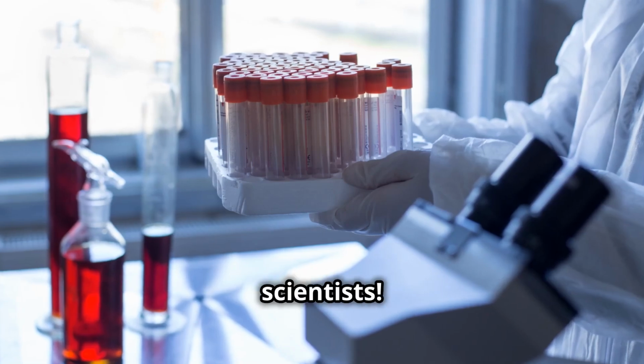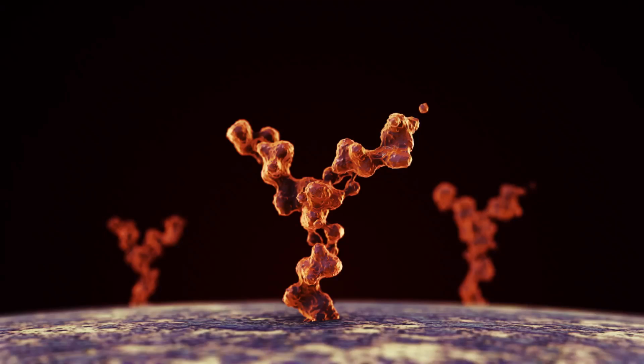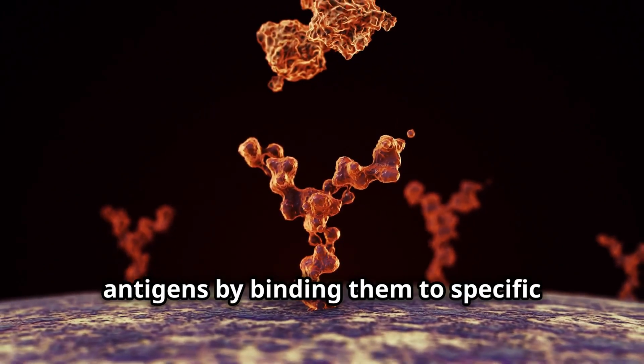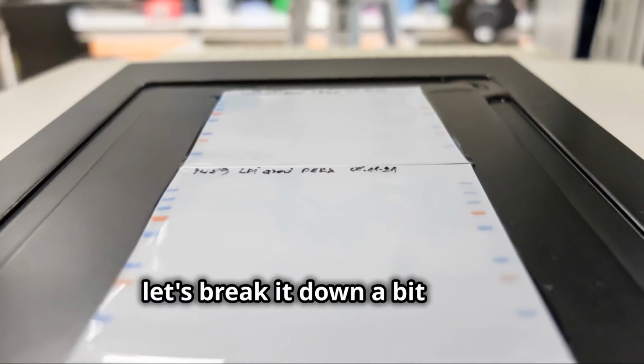Hey there, scientists! Today, I'm diving into the fascinating world of immunoprecipitation. It's a powerful technique for isolating antigens by binding them to specific antibodies attached to a sedimentable matrix. But let's break it down a bit more.